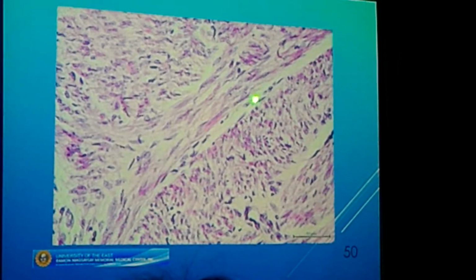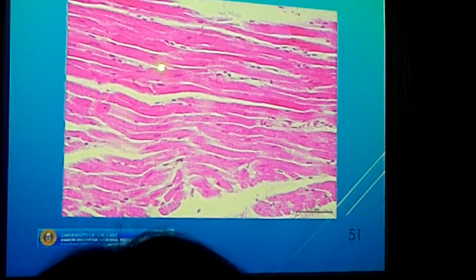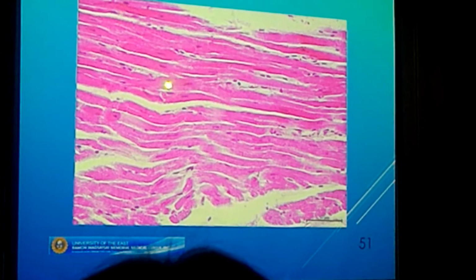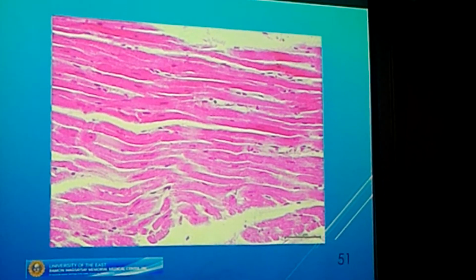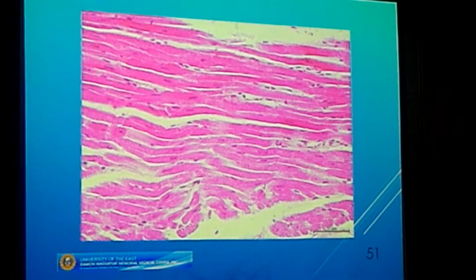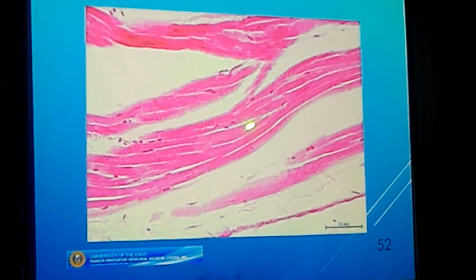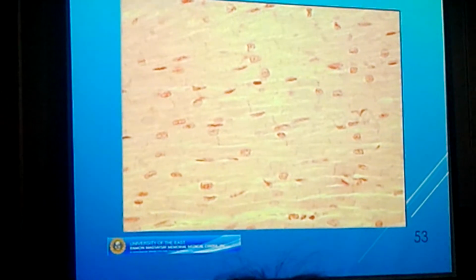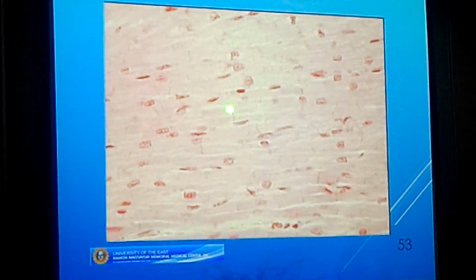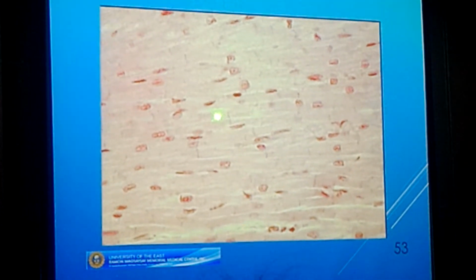So you will be shown smooth muscle with a longitudinal orientation. Cardiac, why? It has branching. But of course, if we ask for the cardiac, this is the better one, because you have the presence of your intercalated discs and a centrally located nucleus.